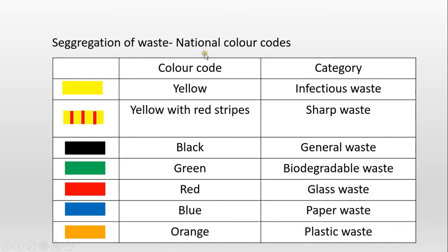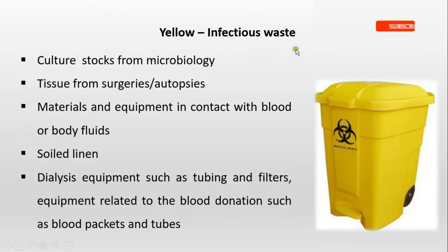Now we will consider the national color code system and the categories of waste under it. Yellow color is for infectious waste; yellow with red stripes is for sharp waste; black is for general waste; green is for biodegradable waste; red is for glass waste; blue is for paper waste; and orange is for plastic waste. We will now consider each category one by one.